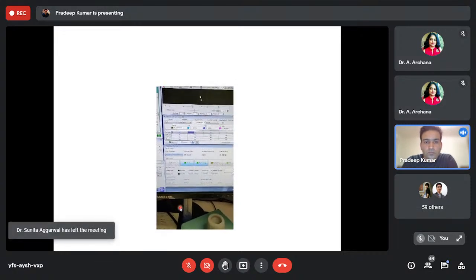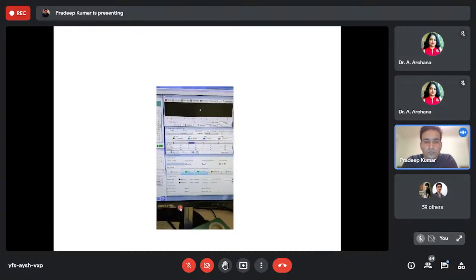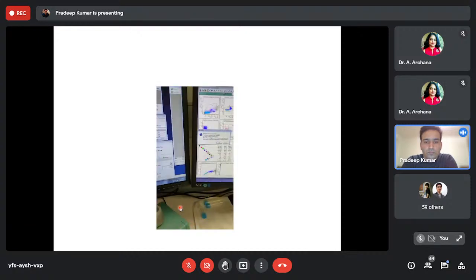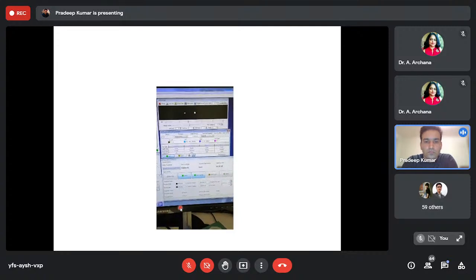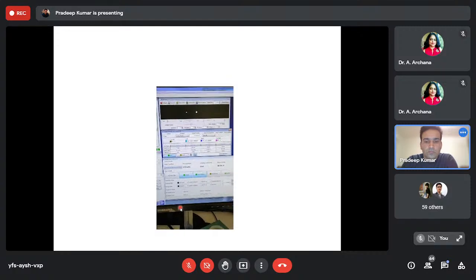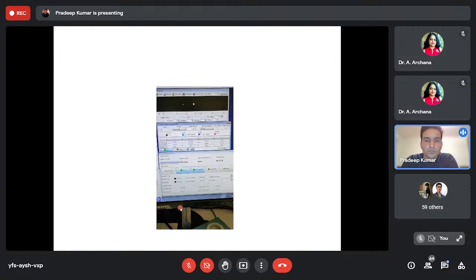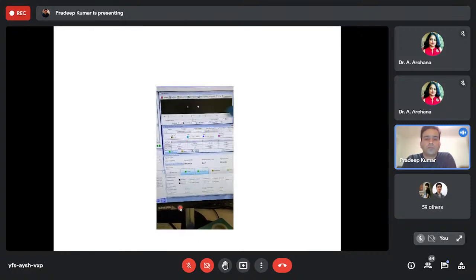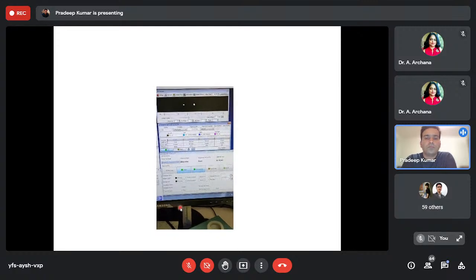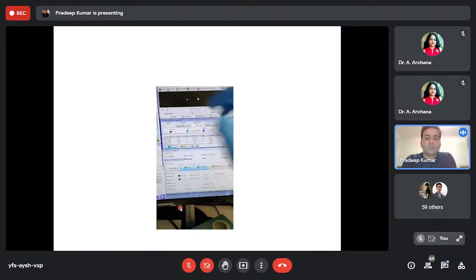So this is the continuous stream that's going into waste. But if I give the instrument command sort, and click on OK, then it starts sorting different populations. You can see that, based on which population is more positive or more available in your sample and which population is less positive, accordingly populations will be sorted. The center stream is an illuminated stream by a laser light, and the side streams are the populations that we are sorting.